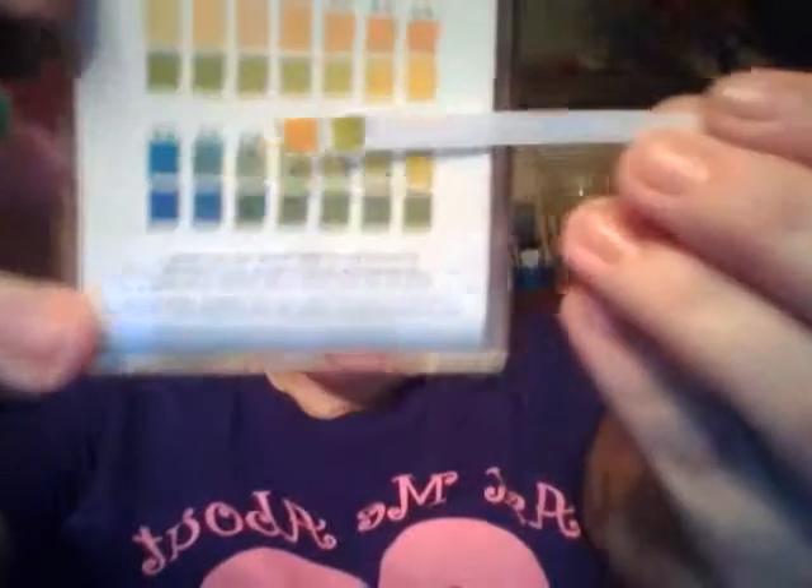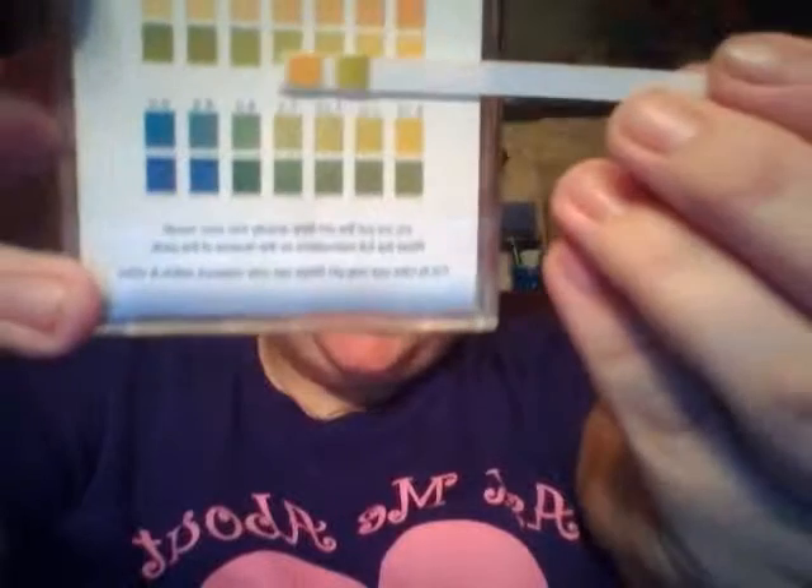Once you put it in whatever you're wanting to test, you're going to wait about 15 seconds, then check it and match it up to your chart here. Find whichever color it matches to, and then you'll know what you need to do to make your pH balance out.